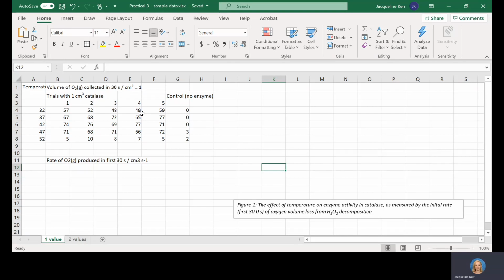You should also be looking at part of good experimental design here. If you're looking at the effect of an enzyme, you should be running a control, which is an experiment where you're using distilled water in place of the enzyme. And reporting in all that data.